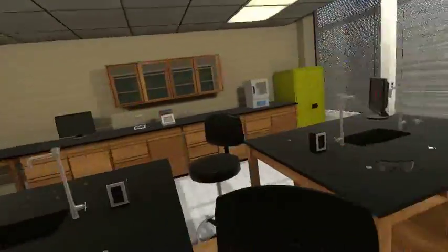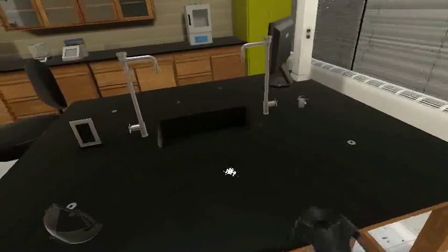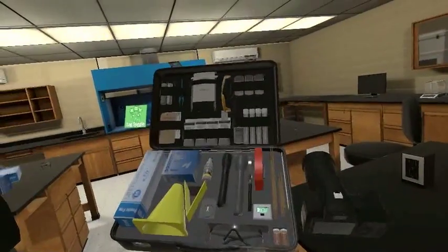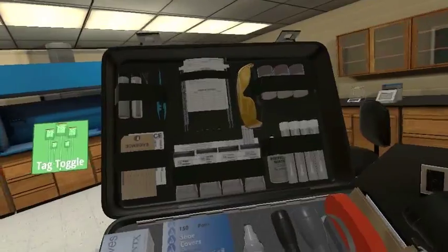When working with drug evidence, we use field test kits to identify the substance. We have a substance on a surface here. We open our CSI kit, and our drug test kits, the field kits, are in the upper half of the kit itself, the CSI kit.